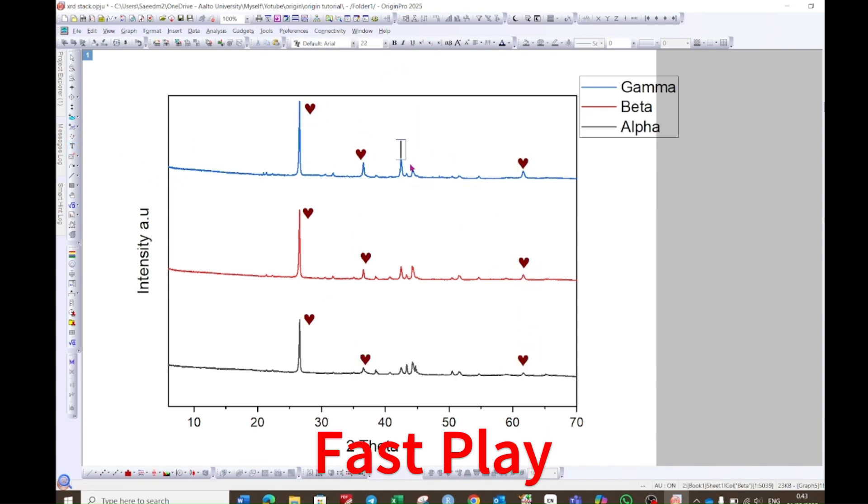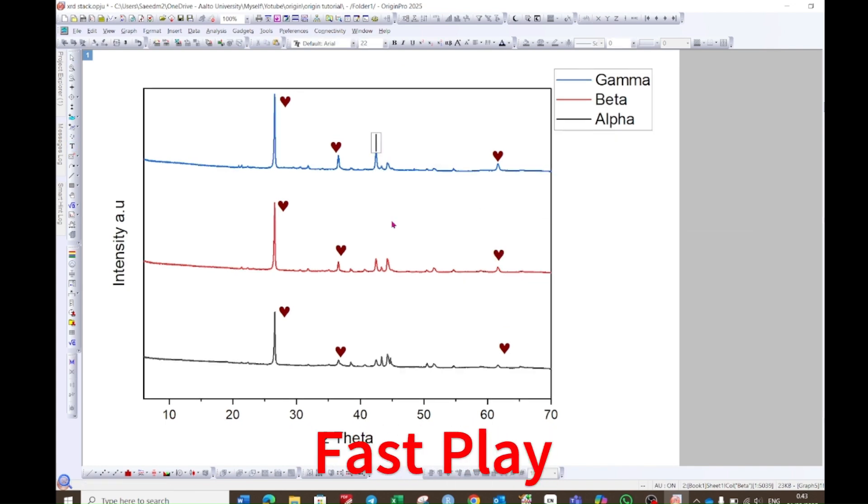Now choose text button again. Click on the peak where you want to insert the symbol. Here you can write the name of the symbol. For example, here if I want to make it as a subscript to number 2, and then here you will see the subscript option.